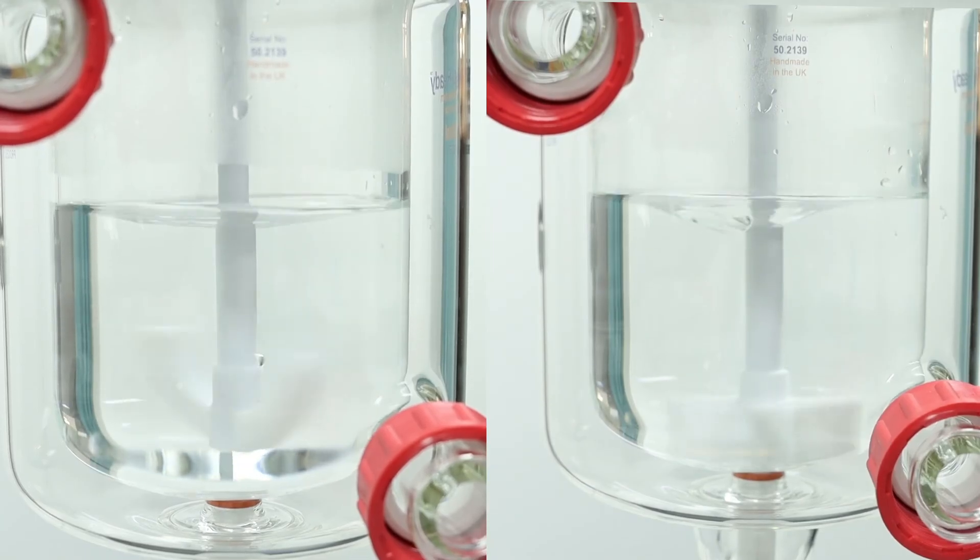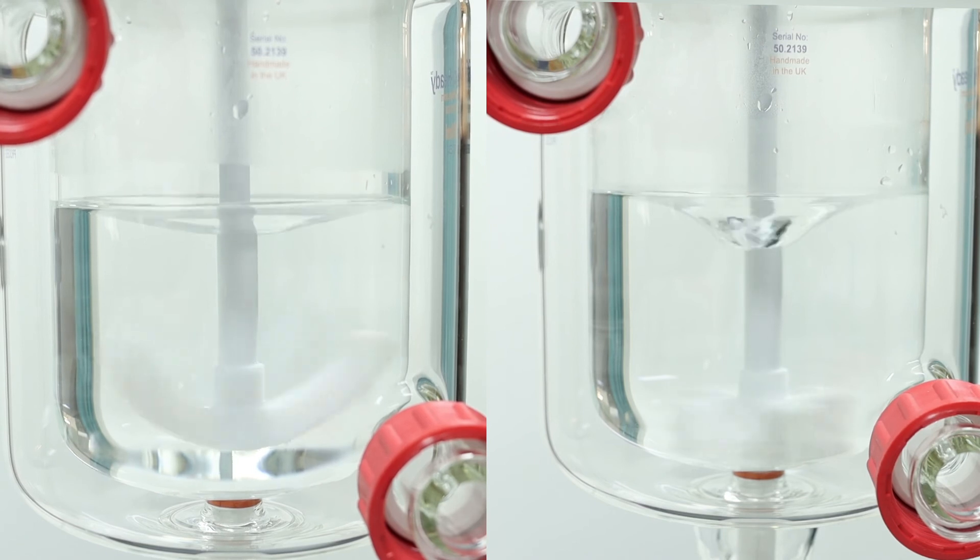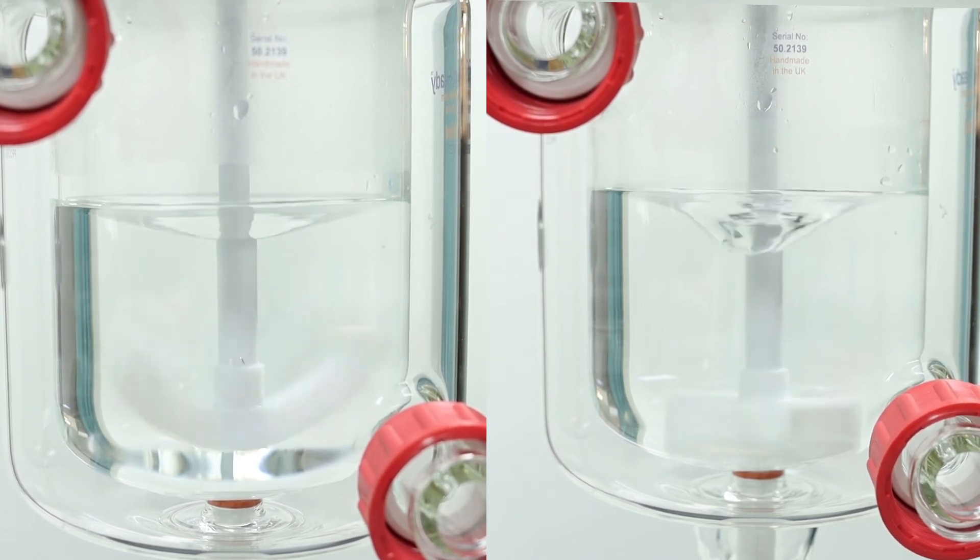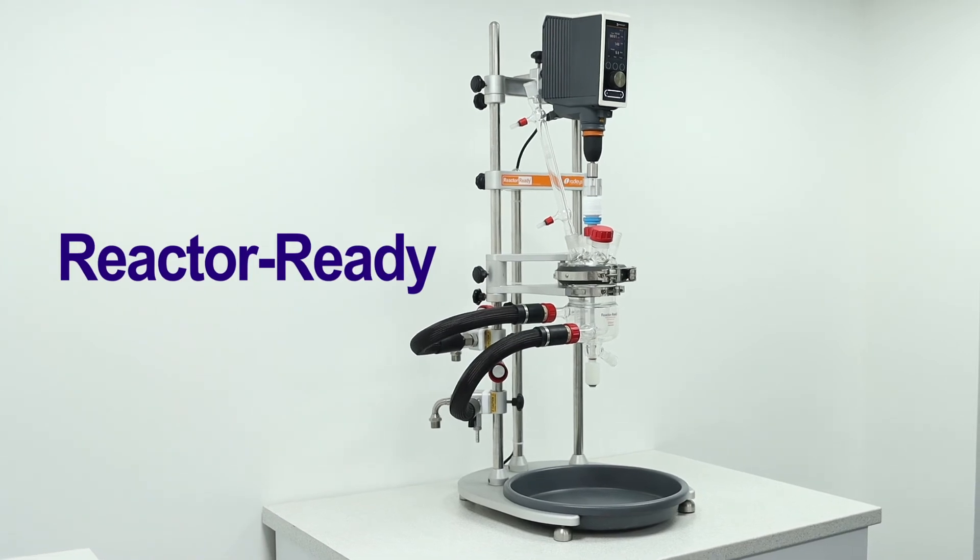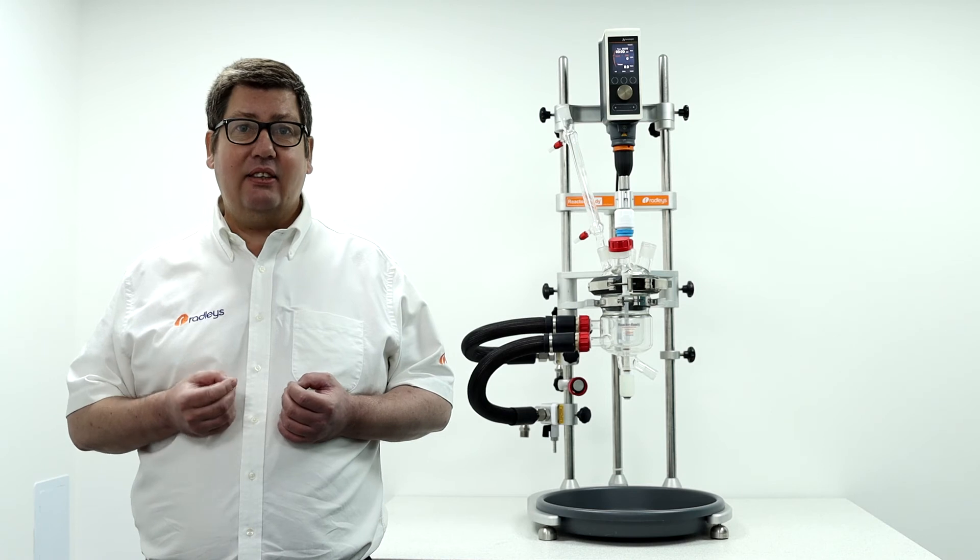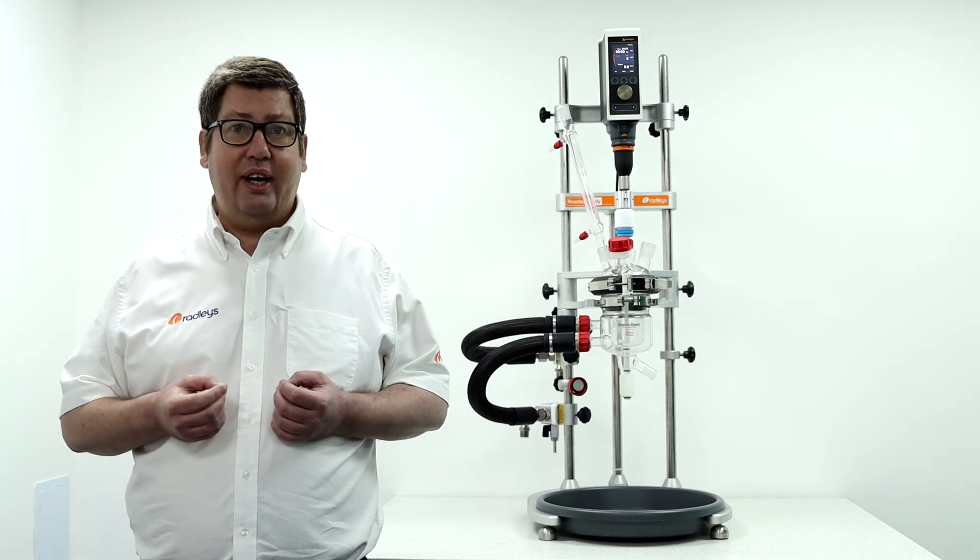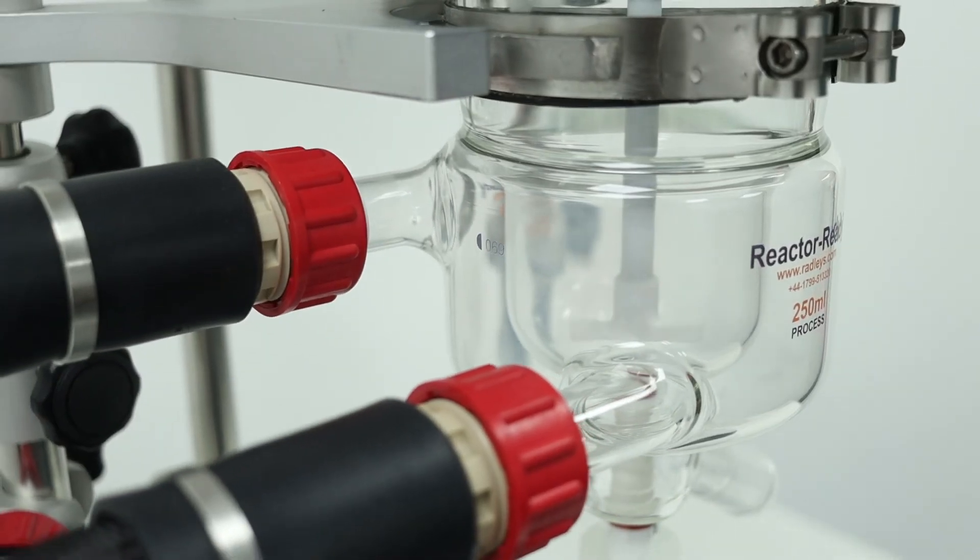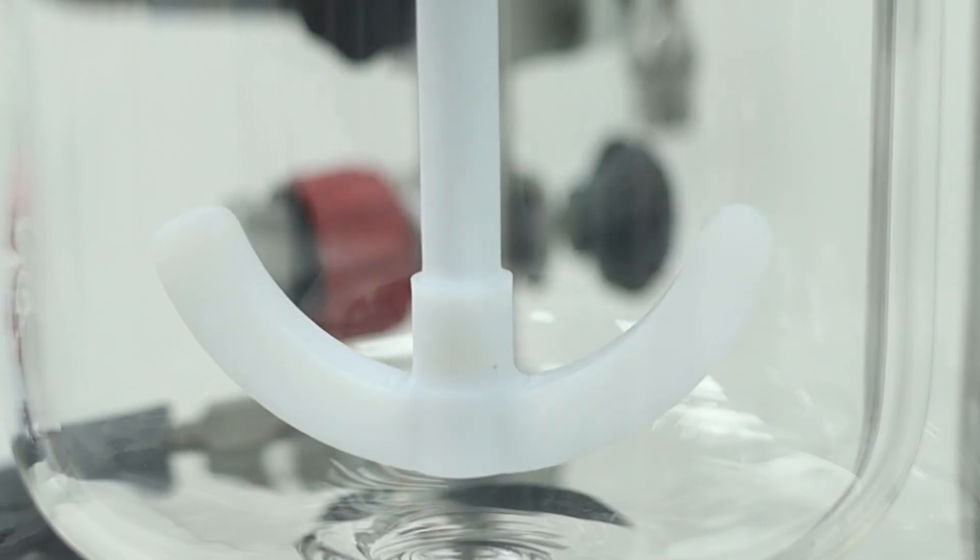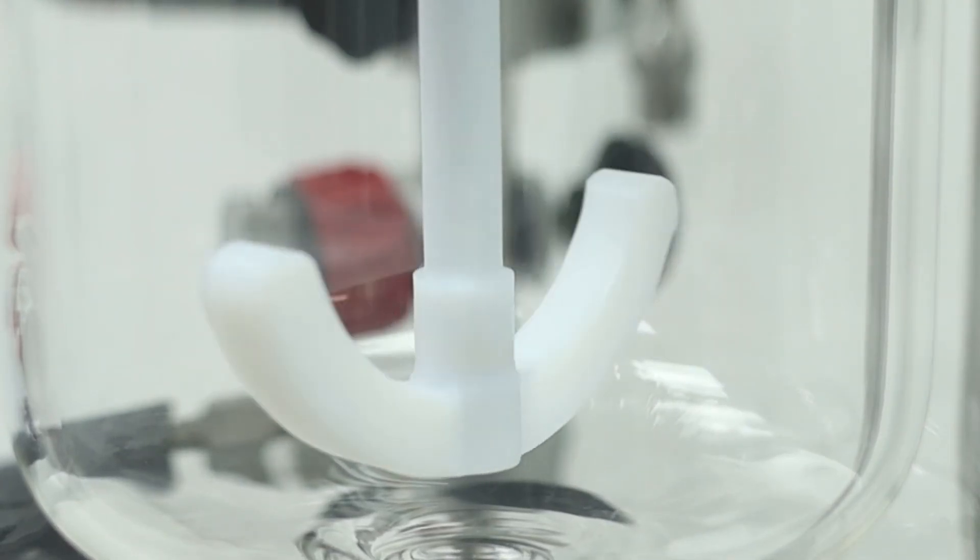The use of jacketed lab reactors enables the chemist to use overhead stirring with a choice of different impeller designs. For example with reactor ready jacketed lab reactors we're able to offer active heating and cooling on reaction volumes down to 500 ml, 250 ml, 100 ml and be able to replicate the geometry of industrial plant reactors with a range of stirrer impellers available.